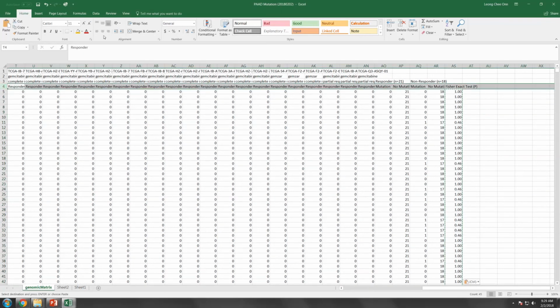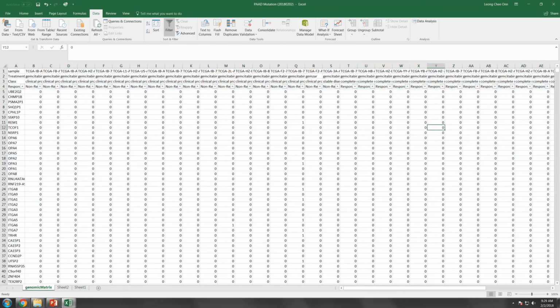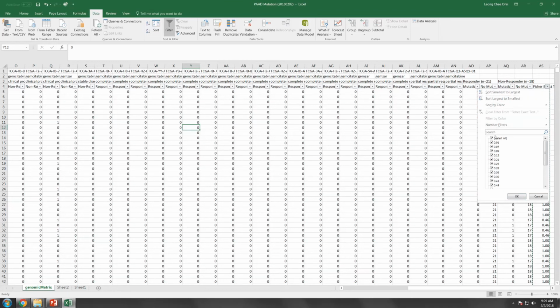Now you can save this at this point. Now let me sort it and see which genes are the most significantly associated.